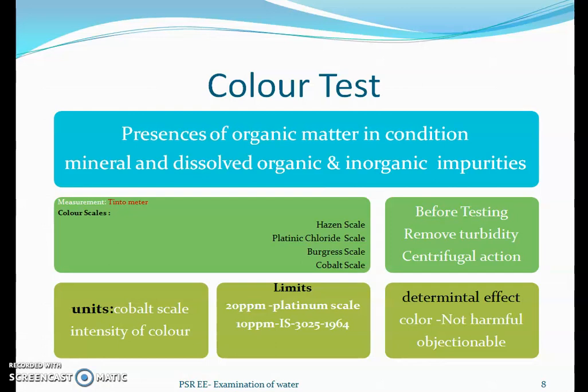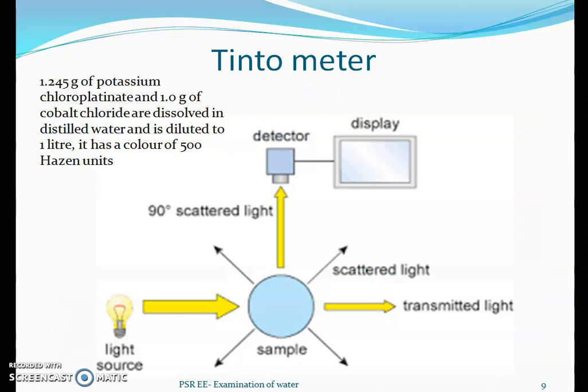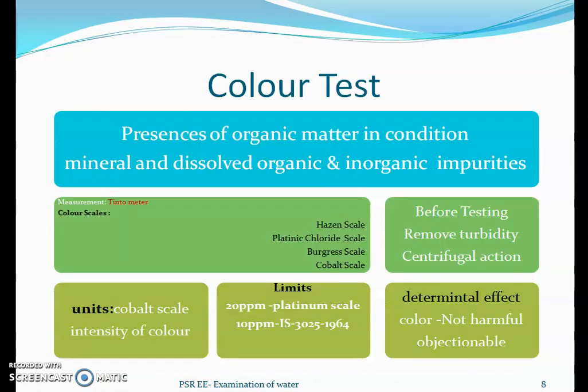Even color is sometimes due to turbidity, so we are supposed to remove the turbidity. Then how can we remove the turbidity from the water? Then we can test.